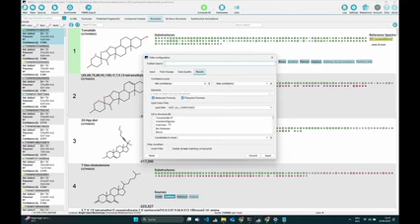What I actually wanted to show here is that you can now filter by hits in structure databases. So if it worked for you and you could import this tomatidine biotransformer database, you can now select this database here. It will check only the first candidates. You can change how many candidates have to fit, or which candidate has to fit, the top 1, top 2, top 3, or whatever. And if you selected this, you can now just click on apply.